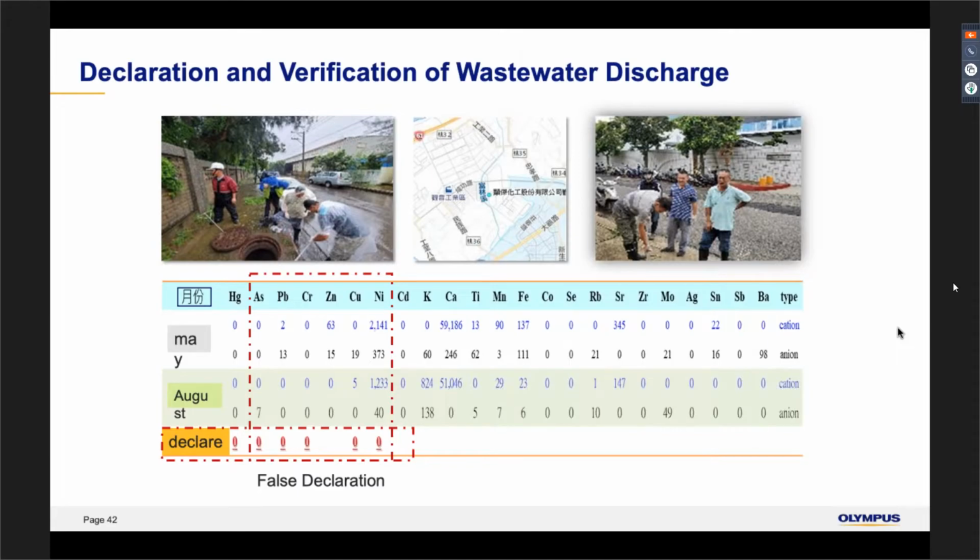So for the liquid sample itself, it actually depends a lot on the homogeneity of the liquid. Because as you guys know, when we talk about XRF, the most important thing is homogeneity. Sometimes if your liquid contains some precipitate or particles and it's not homogeneous, in the end your XRF data might be just testing the subsurface of the liquid, and it won't be representative of the entire liquid itself.